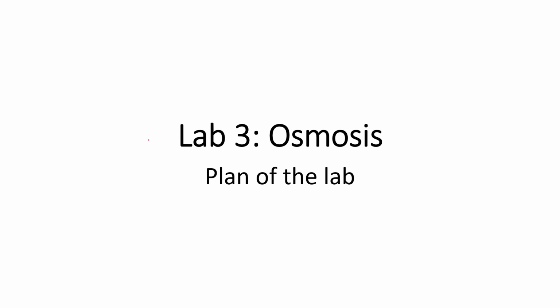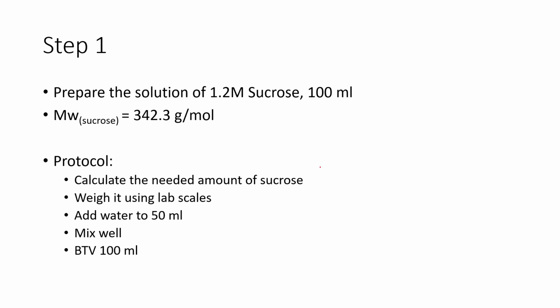Hello everyone, so today we have lab number 3 and it is about osmosis. This is a short video about the plan of the lab. We have 4 consecutive videos for this lab, and during each of these videos you will be doing some part of the experiment.